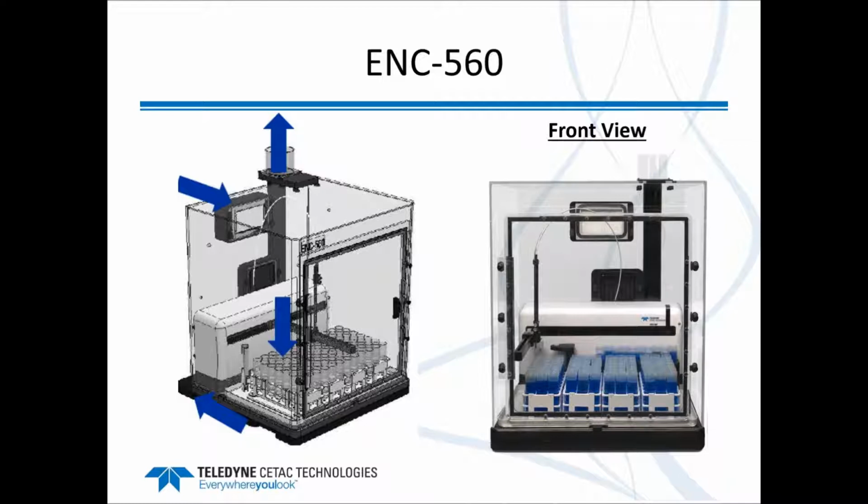So this creates a very efficient airflow of material out of the enclosure interior, and all of the air that travels over the samples is filtered through the HEPA filtration system, also eliminating the potential for any contamination that might come from the vent system itself.